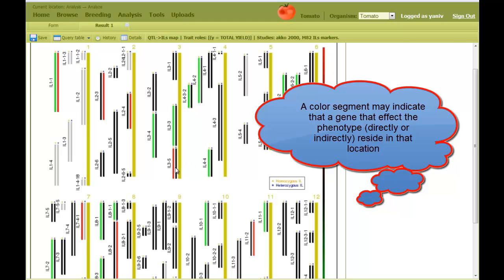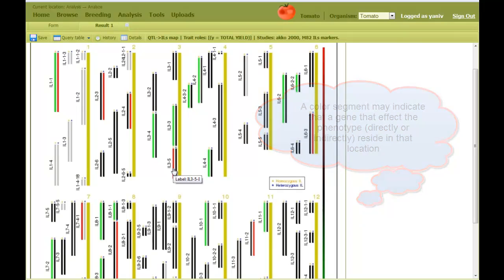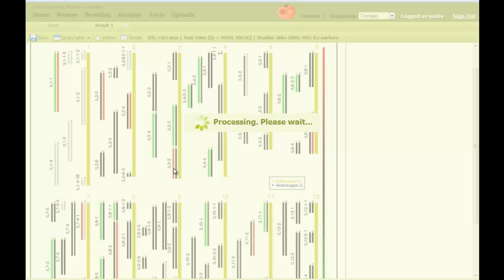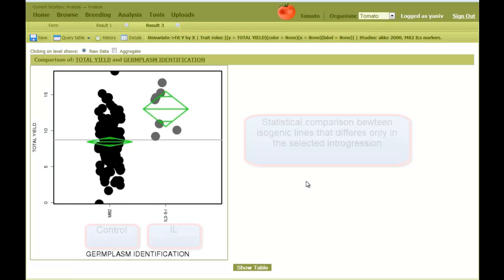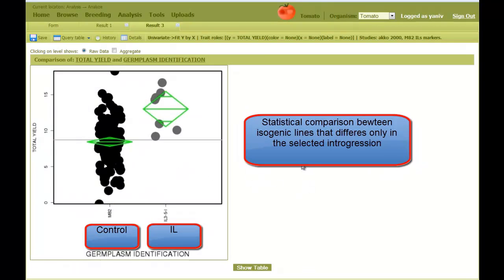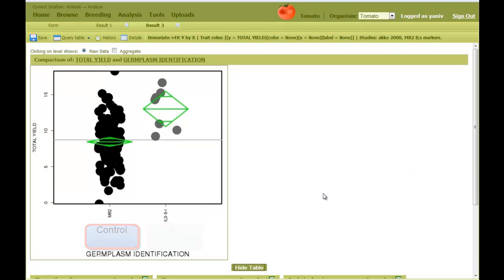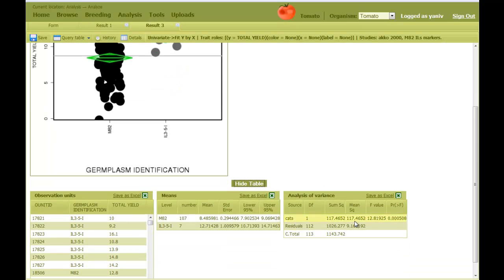If I click on a segment, the statistical comparisons of this integration to the control, which is M82, is displayed in a new tab. Each data point represents a replicate for each genotype. On the bottom there is the analysis of variance table, and the p-value.